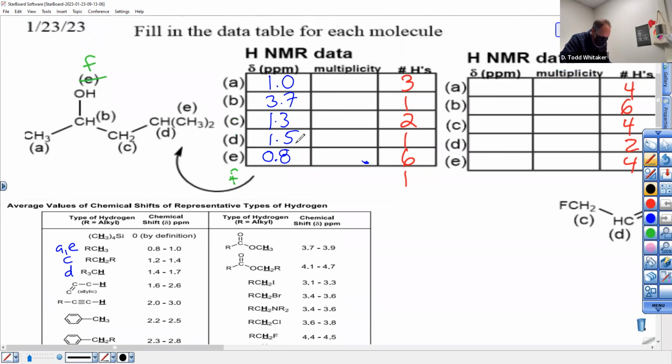And then I look at what I've already come up with, and I don't want to draw on top of something else. This is just practical. It's nothing chemistry. And so invent a number. And you're saying, why is that? Why can it be anywhere in there? Why does it change? Well, the fact is that peak's position is dependent on hydrogen bonding. If it's highly concentrated, that means there's a lot of hydrogen bonding going on, and that will shift the peak one way. And if there's less hydrogen bonding, it'll shift the peak another way. Okay, so don't worry about using that as a prediction, but I'm just explaining. You never have to think about it again.